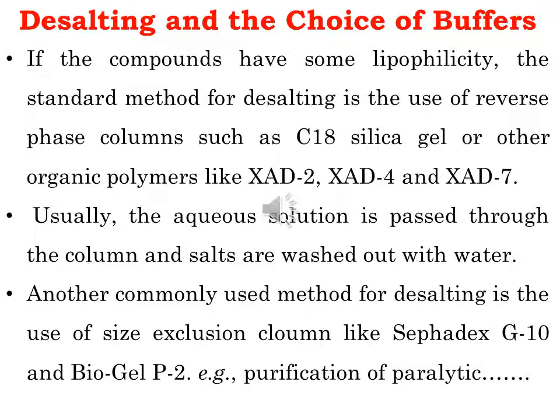This, however, is not always the case because there are some unpredictable interactions between the compounds and column supports, such that the predicted elution order can often be reversed. These interactions can hold advantages for the extractor and can be used to isolate specific types of compounds.